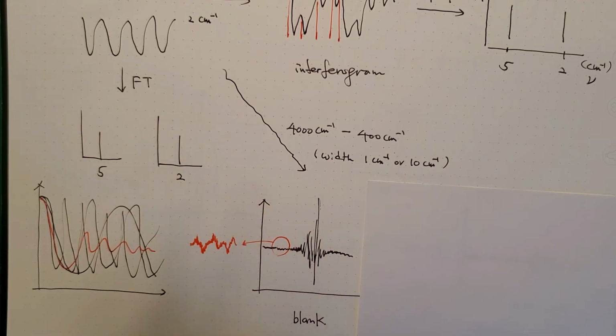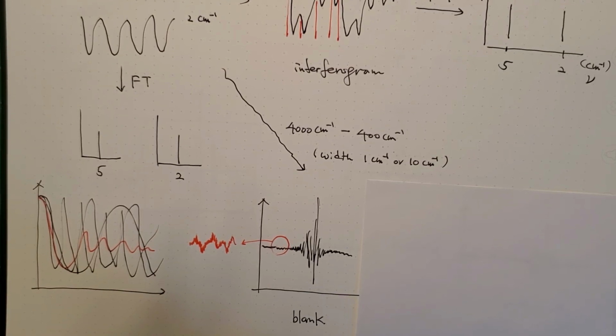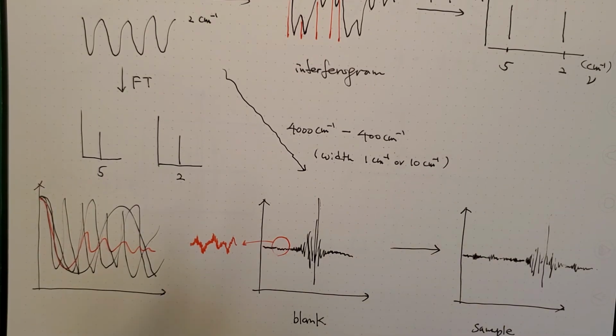Then when this blank interferogram is interacting with the matter, some of the vibrations will be absorbed to excite some modes of vibrations that are active in the spectroscopy that you are running. Then the interferogram that is missing certain photons after absorption, or gets weakened by being partially absorbed, will be changing something like this.